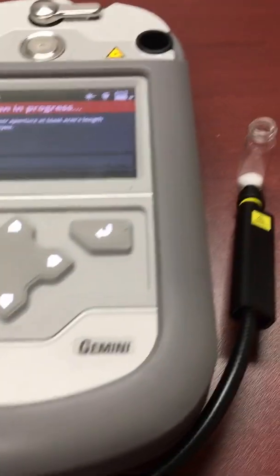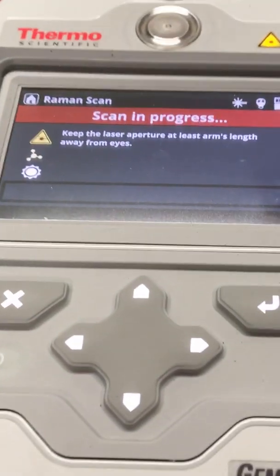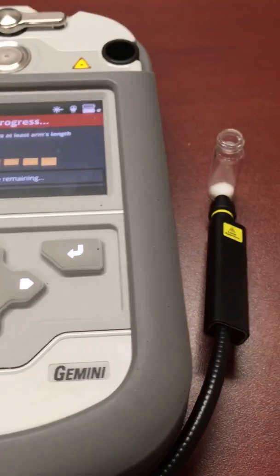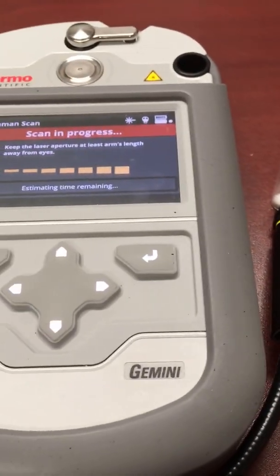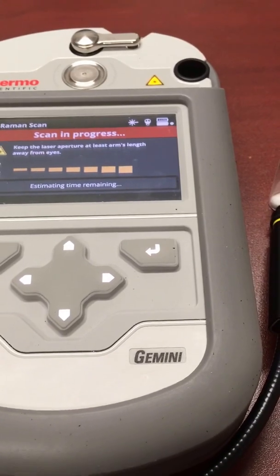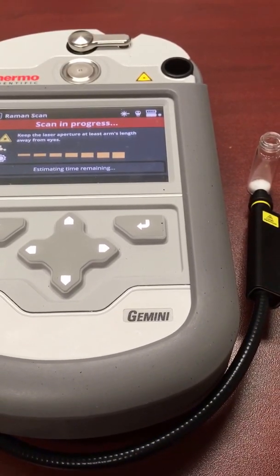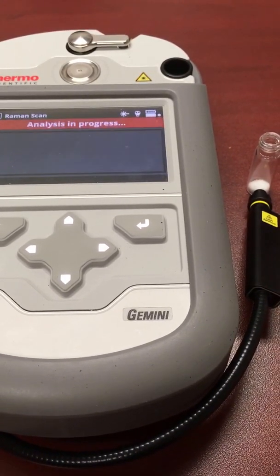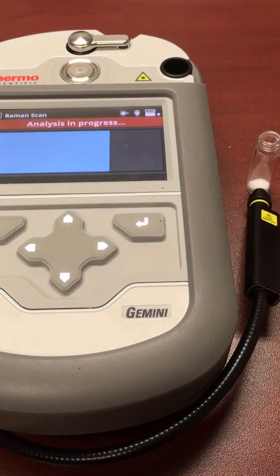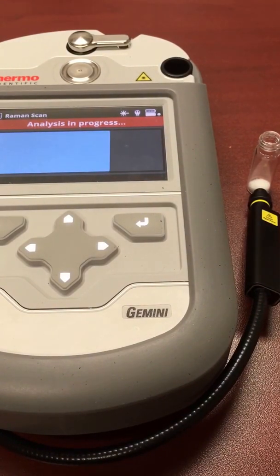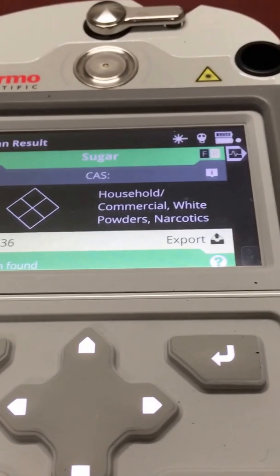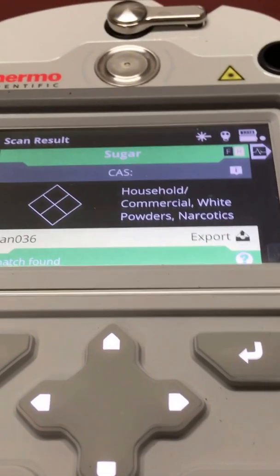Okay, so it's scanning. And the result shows that the substance is sugar.